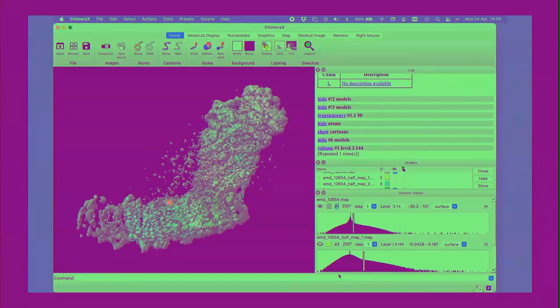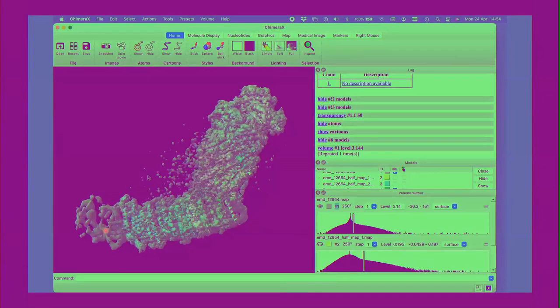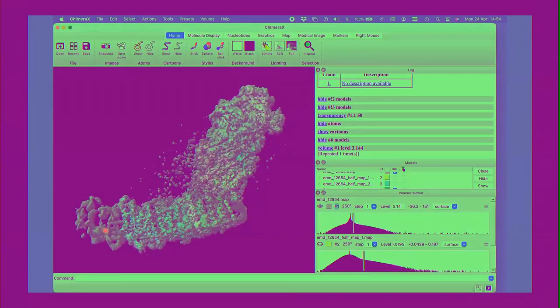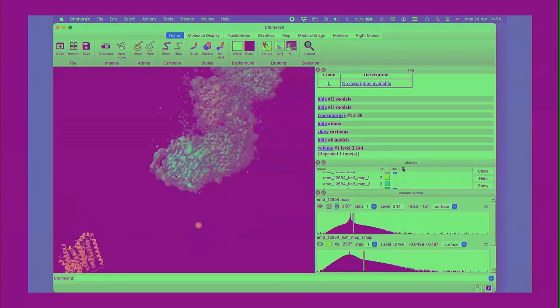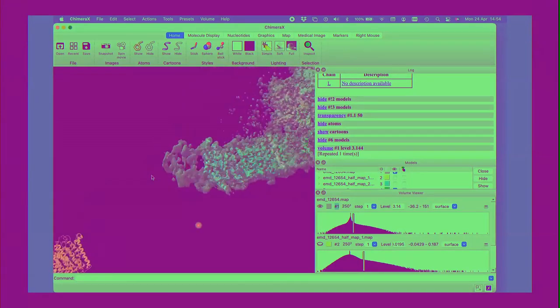Right, so this is ChimeraX, and the scenario here is, let's imagine I've placed everything except for chain L. And I think this has got to be where my chain L goes. So I can rotate it around and see what we've got here. The first step is just to center approximately on where you think you want to look for your molecule.